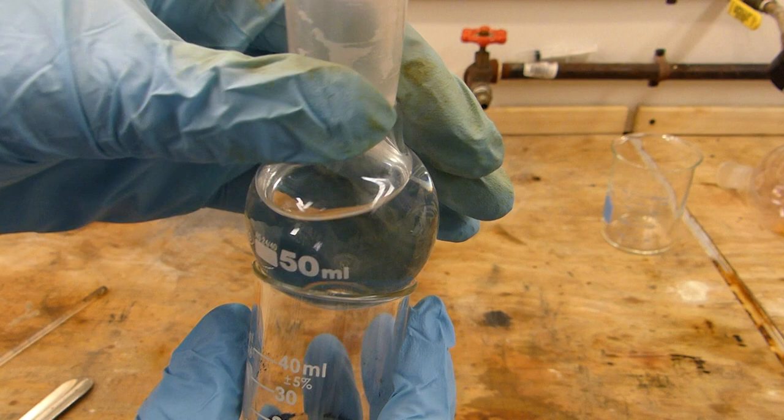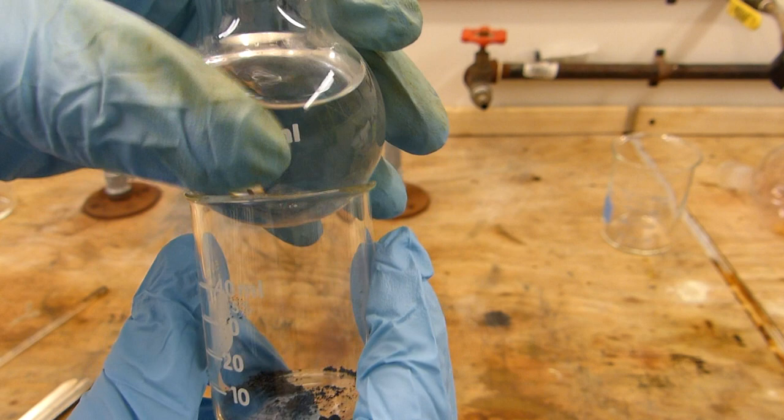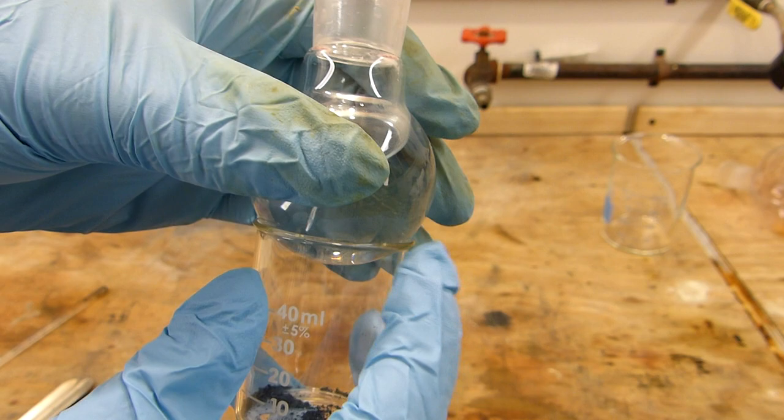And so by heating this beaker I'll be able to evaporate this iodine to form that purple vapor. Now if I place something cold on the top of the beaker like this 50 ml round bottom flask which is full of pretty cold tap water, I'll be able to sublime the iodine off the bottom of the flask.